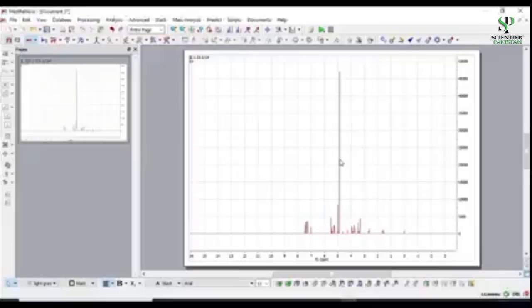This proton NMR spectrum was recorded in methanol on a 600 megahertz spectrophotometer, and you can see that here we have the NMR scale, the frequency scale in ppm, and here is the intensity. And at 0 ppm you see a very small peak which belongs to the TMS, of course. So now we have to bring this spectra into a readable, understandable format, because these peaks are very small. We cannot interpret it, or we cannot see it clearly.